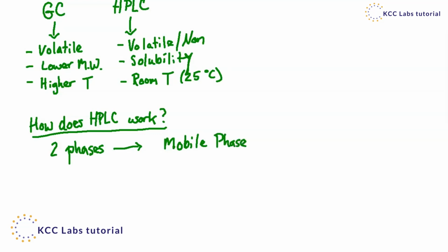And you can manipulate the polarity of the mobile phase by mixing and matching. So certainly water and alcohols are going to lead to more polar mobile systems, and that will mobilize polar compounds. Whereas you can scale it back. You could go mid-range with something like ethyl acetate or methylene chloride, and then you could scale back even further. And if you really want to get more into the nonpolar region, you could start working with maybe some hexanes or some of your ethers, where you would have a better movement of your nonpolar compounds in a situation like that.